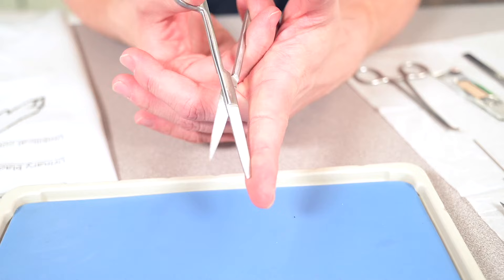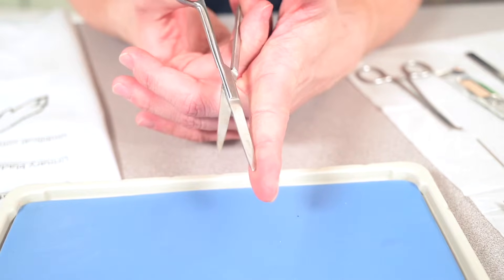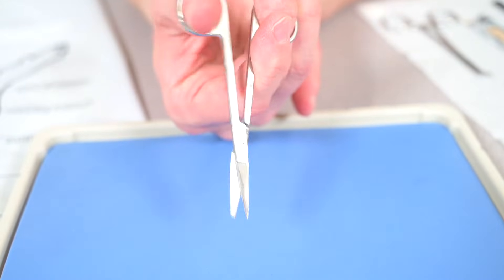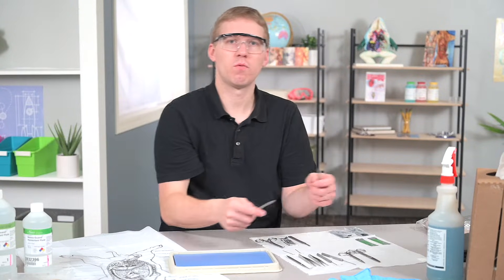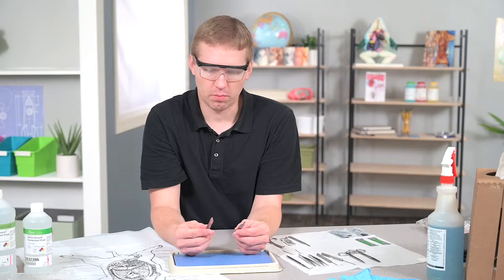You might see scissors with a blunt end, a curved end, or a straight and sharp end, which are more commonly used. The last tool is one of the main ones you'll be using during dissection and is used for precise cutting — the scalpel.